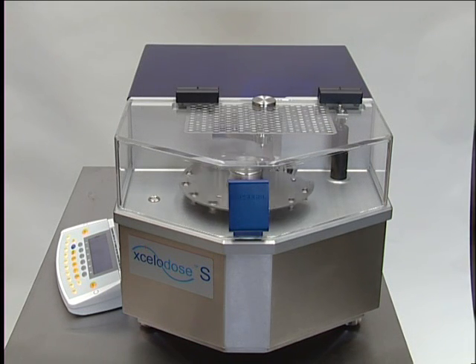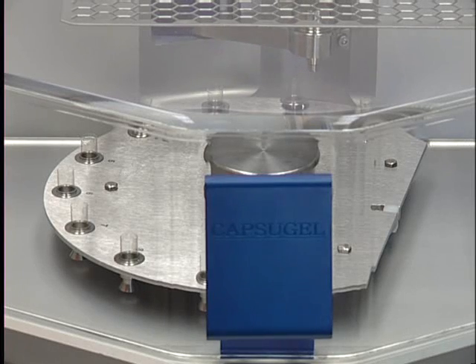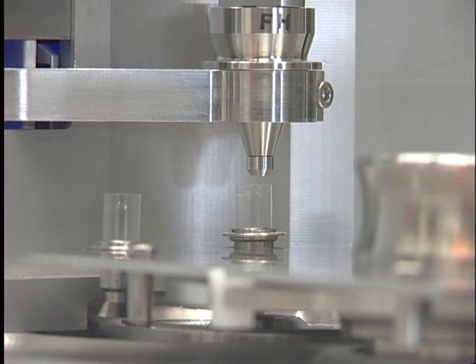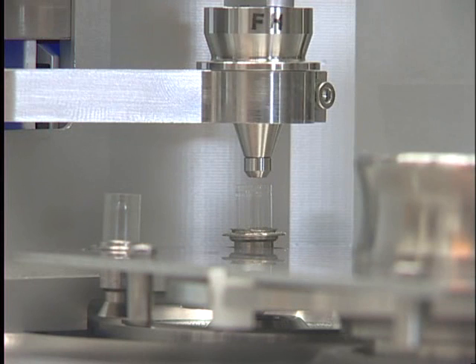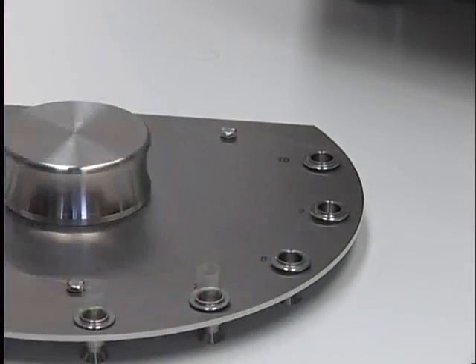This sequence shows one milligram of powder being filled into size zero capsules. Each capsule base is tared and the fill weight of each capsule is recorded. While a run is being undertaken, a second run can be made ready.